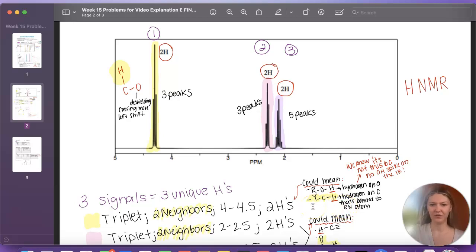We already know from the previous 2 charts that we're going to have a carbon bonded to an oxygen for that part of our ester. So this is probably going to be the set of hydrogens that's bonded to the carbon that's bonded to the oxygen. This could also have meant that there's an oxygen-hydrogen bond, but I knew this wasn't true because of the IR spectrum.